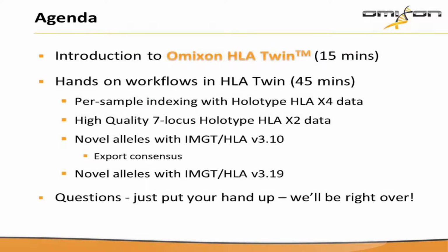We are going to be showing you how, when a sample with a novel allele was analyzed with the IMGT database version 3.10, a novel allele was detected. I'm going to show you how you can export that consensus sequence in order to submit it to the database.